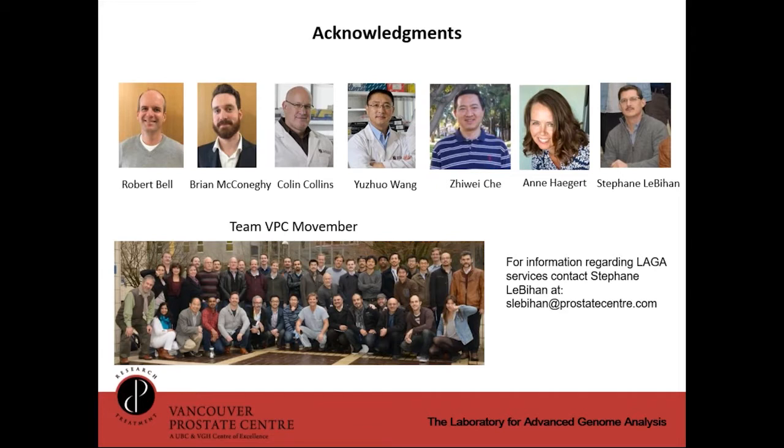But I think by even just using those three flattish samples, I was actually pretty surprised. That's incredibly usable for all intents and purposes. And if I compare to the previous aCGH data, I didn't drill in and zoom into any chromosome views, but when I looked at them, I was incredibly surprised how accurate the focal changes were. So yes, more is always better, but in this case, I was very happy with the way those three flatter samples worked.